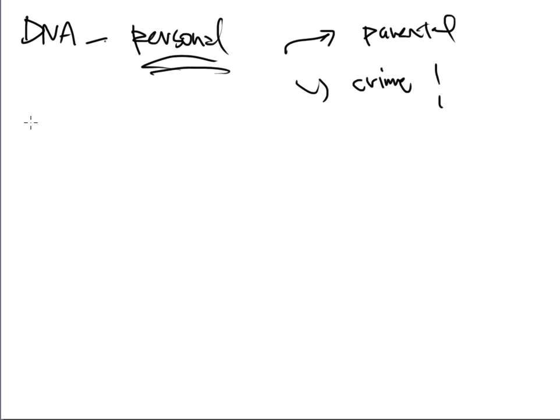So in this particular video, we're actually going to be focused on our own personal DNA. And each one of these cases was something similar, right? The reason that we do this is because we want you to go through some of those training protocols a little bit before we actually start doing the real experimentation part of this: the DNA extraction, the PCR, the electrophoresis, and so forth. Get your feet wet. That way, when you get to this point, you'll feel a little bit more comfortable doing what you're doing.